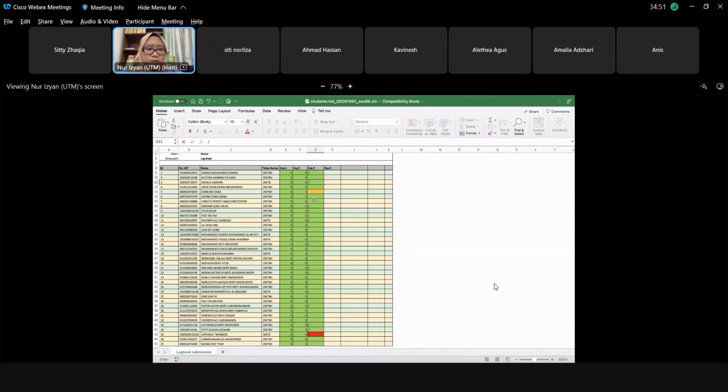Dr. Faizwan just now mentioned that to determine the concentration of the zinc in the solution, first of all, we need to prepare the standards, isn't it? So, how many standards did Dr. Faizwan prepare just now? Krista, how many standards did Dr. Faizwan use just now?